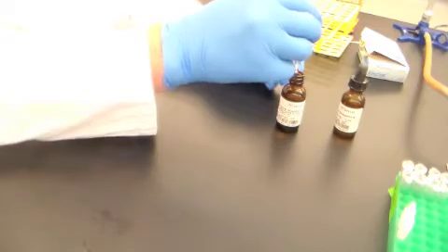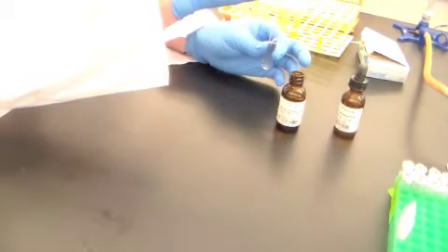So again, to this uninoculated control, I'm going to add 1, 2, 3, 4, 5 drops of nitrate A. Mix it slightly, and now 5 drops of nitrate B reagent. 1, 2, 3, 4, 5.